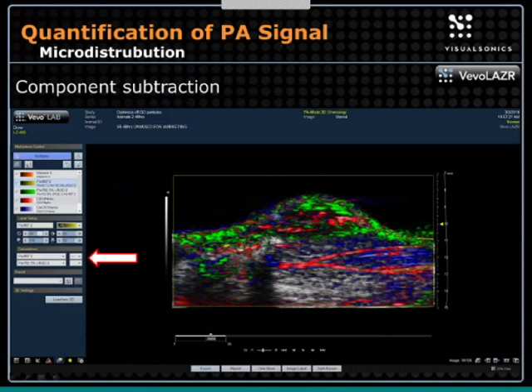And that's exactly what we're doing here in this panel. You can just do it very simply in the software. And sure enough, the green signal that you're seeing now is actually the green signal that's left over after you've subtracted out the signal from the nonspecific uptake. So just plain old doing the subtraction is one way to do this analysis, and then we can quantify this as well, which I'll get to. So there's one really, really simple way of doing it.